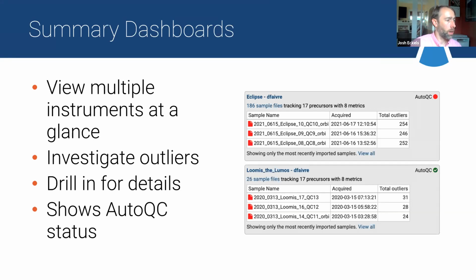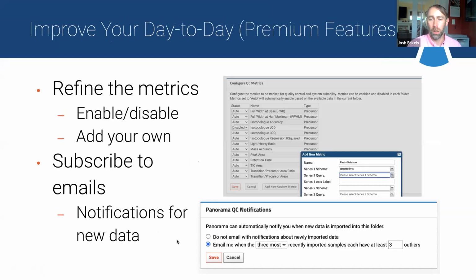So we've got the share the results. So yeah, it looks like a pretty good range. About a quarter of people have one instrument in their lab, and then it's kind of evenly distributed across 2, 3, and more. So especially for groups that have multiple instruments, these kinds of dashboards I think can be really helpful to understand the lab at a glance without having to look at each one.